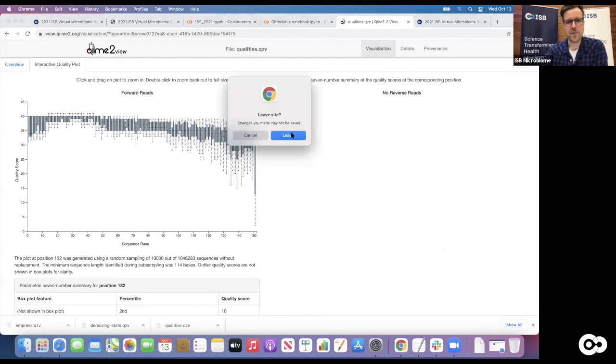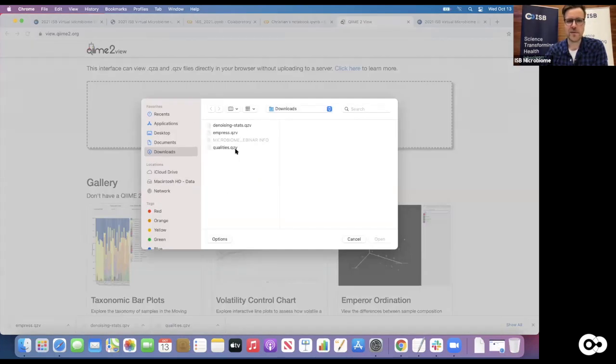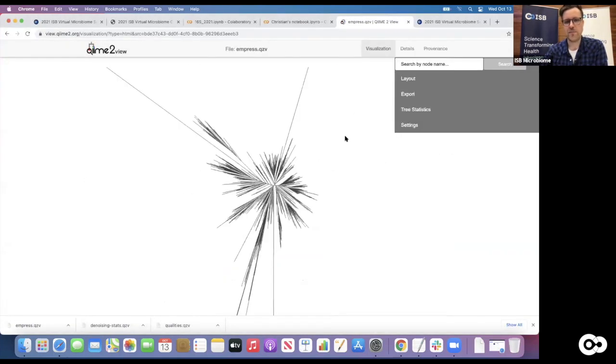So it's pretty convenient. Also, I should note that sometimes you might be worried that if I upload my visualization here, is it lying on some server somewhere which is not my own? Well, no. Everything is run in your own browser. No data actually gets uploaded anywhere. Your browser is used like a magic machine that extracts that zip file and visualizes the web page. It runs all locally on your machine.